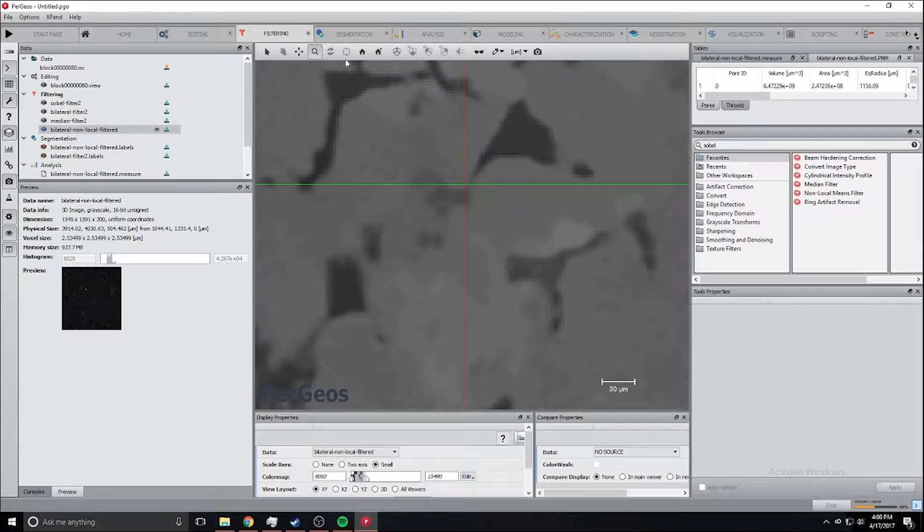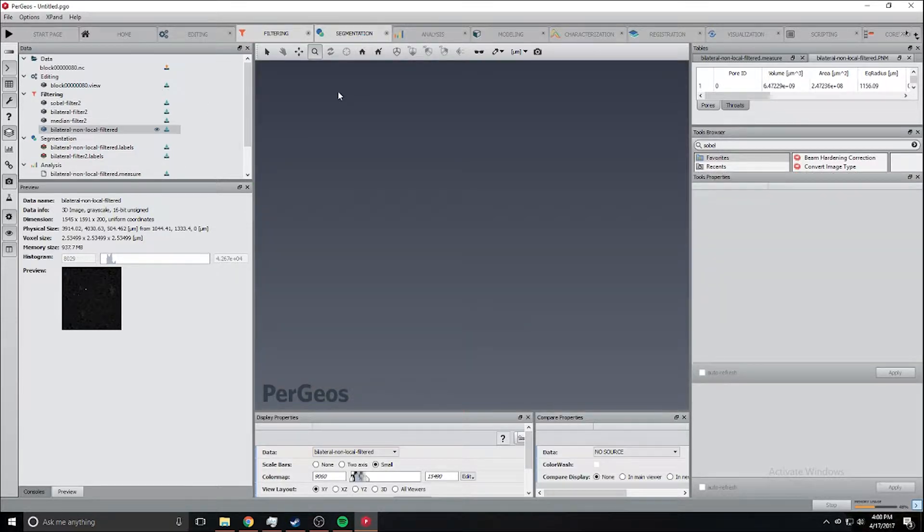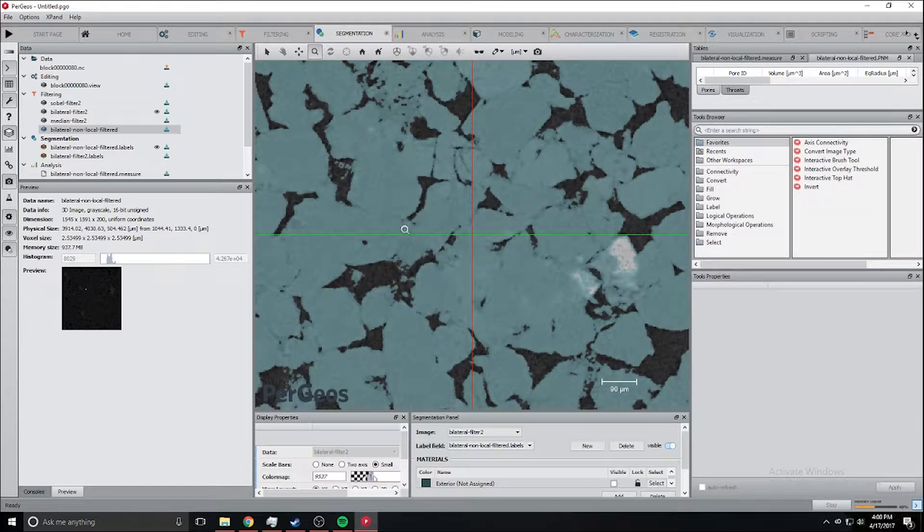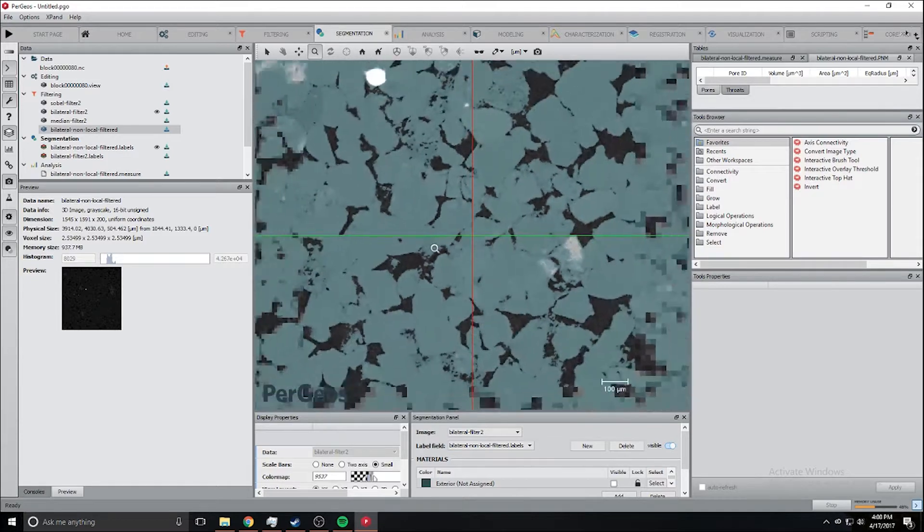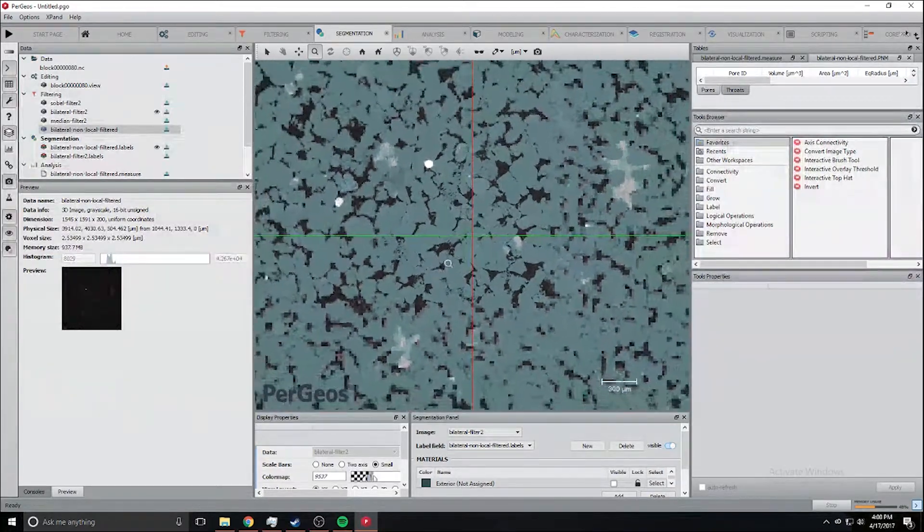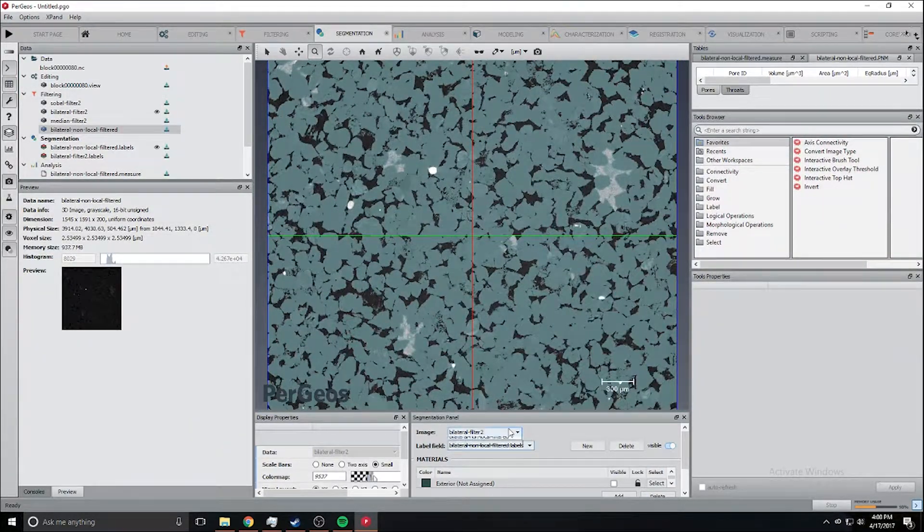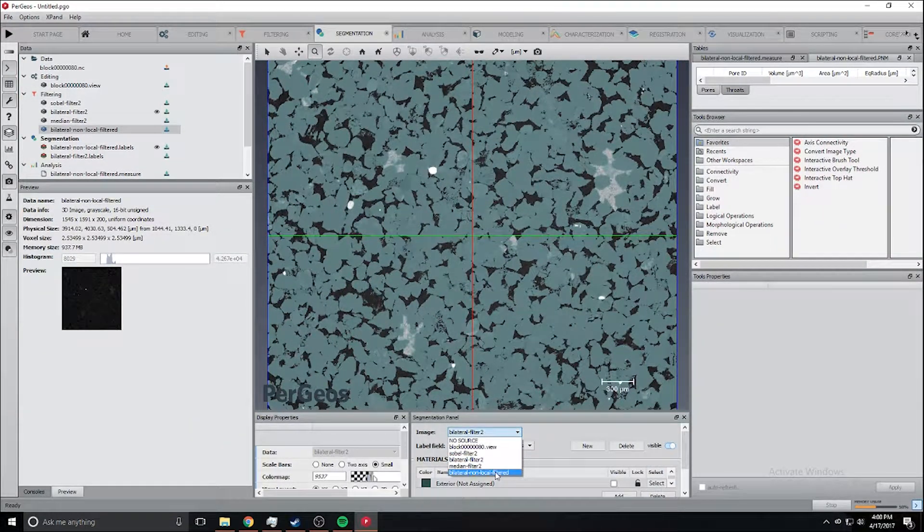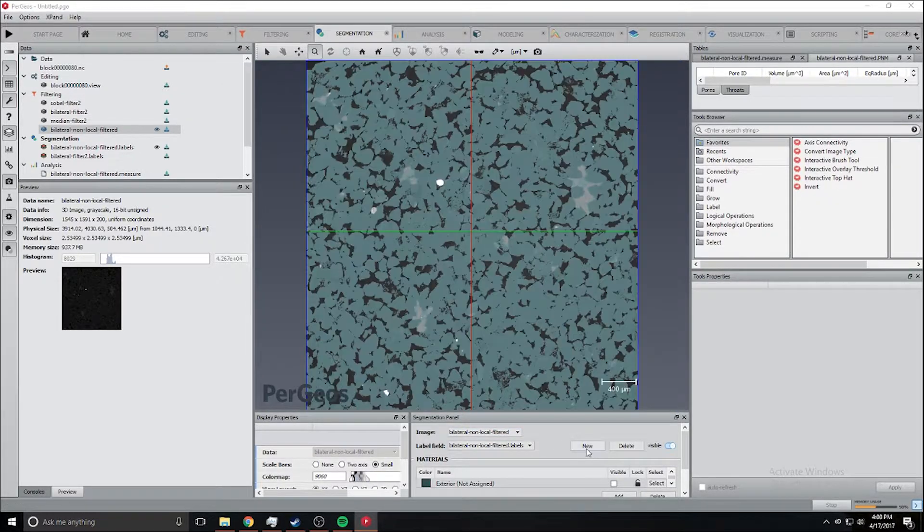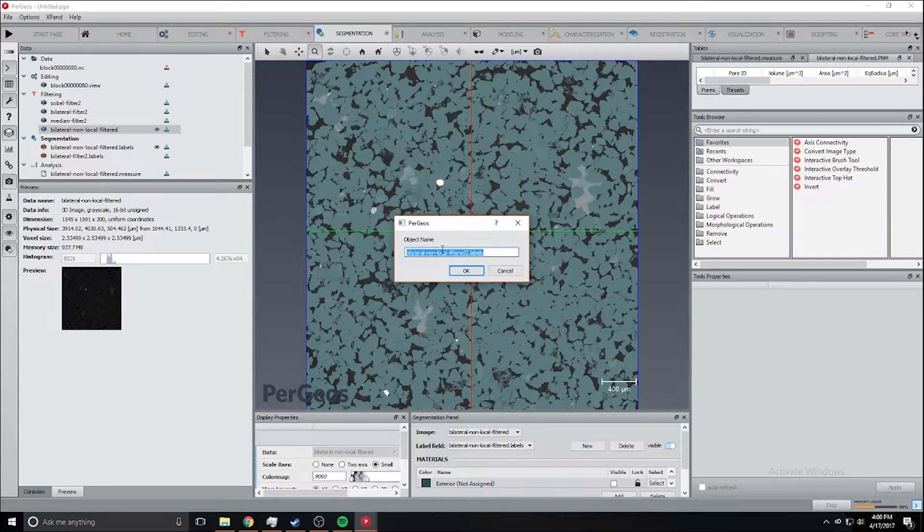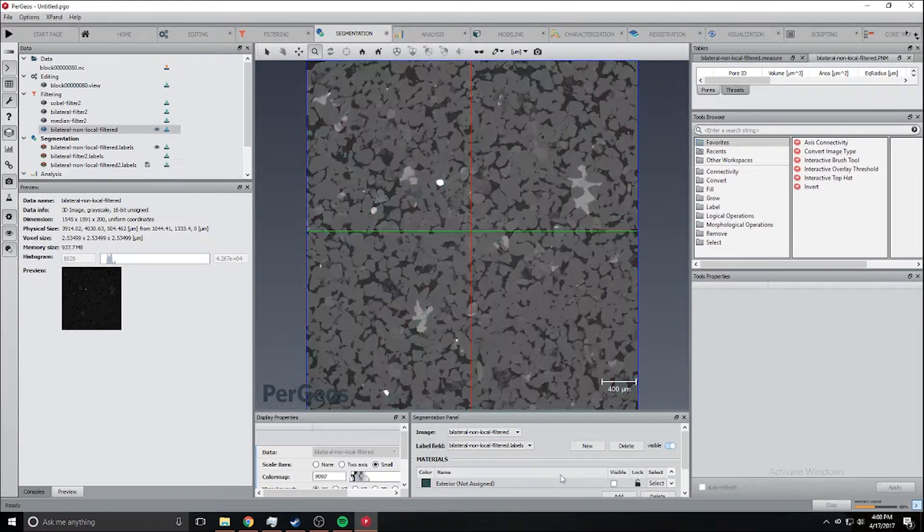Now it's time to take a look at segmentation. As you can see I already segmented it but we're going to go over it again. We're going to create a new label space label field.